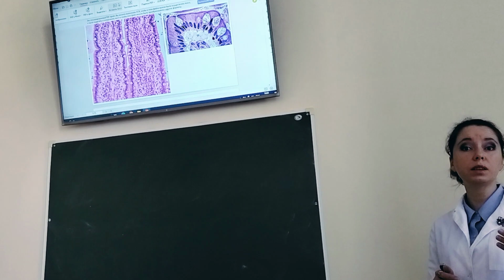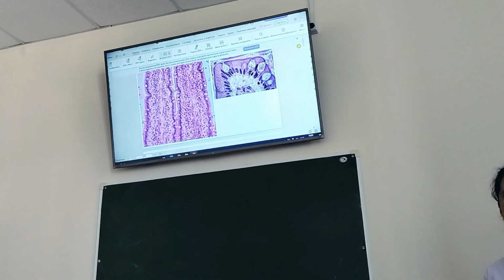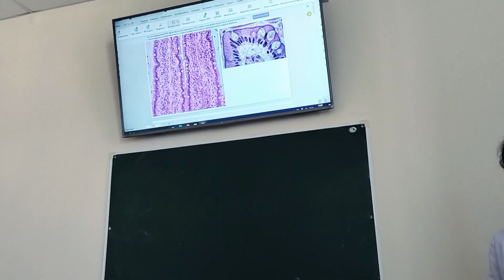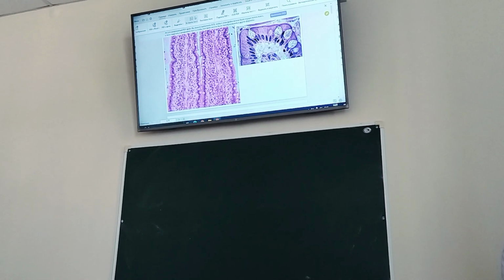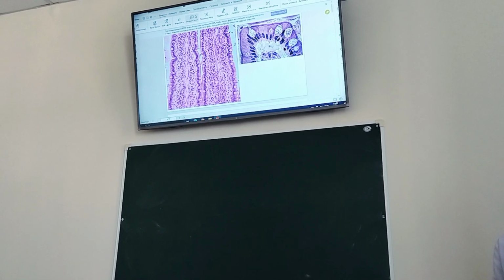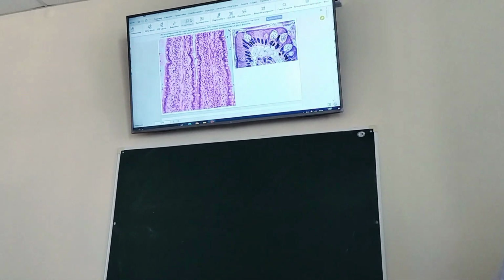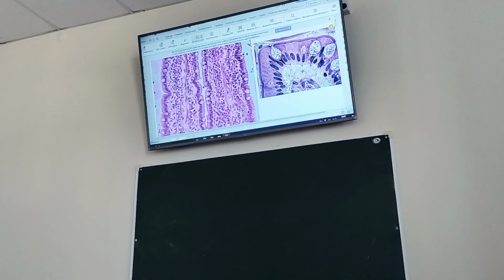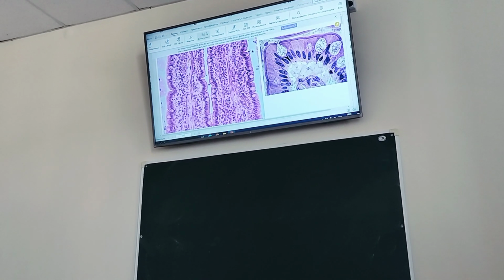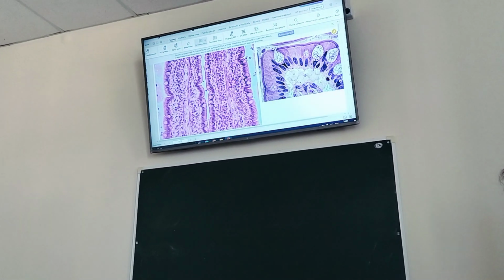Then staining properties of the cytoplasm, granules, are they present? Cytoplasm basophilic, weakly basophilic, weakly oxyphilic. So today we will not stop once again on it. And some more slides. Now from the beginning.